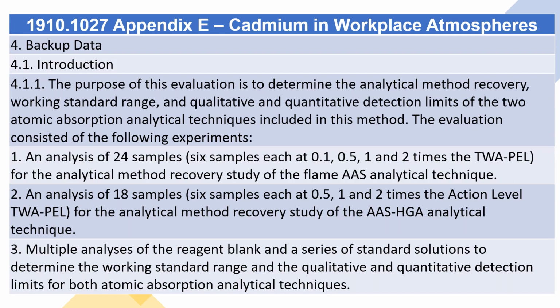4. Backup data. 4.1. Introduction. 4.1.1. The purpose of this evaluation is to determine the analytical method recovery, working standard range, and qualitative and quantitative detection limits of the two atomic absorption analytical techniques included in this method. The evaluation consisted of the following experiments.